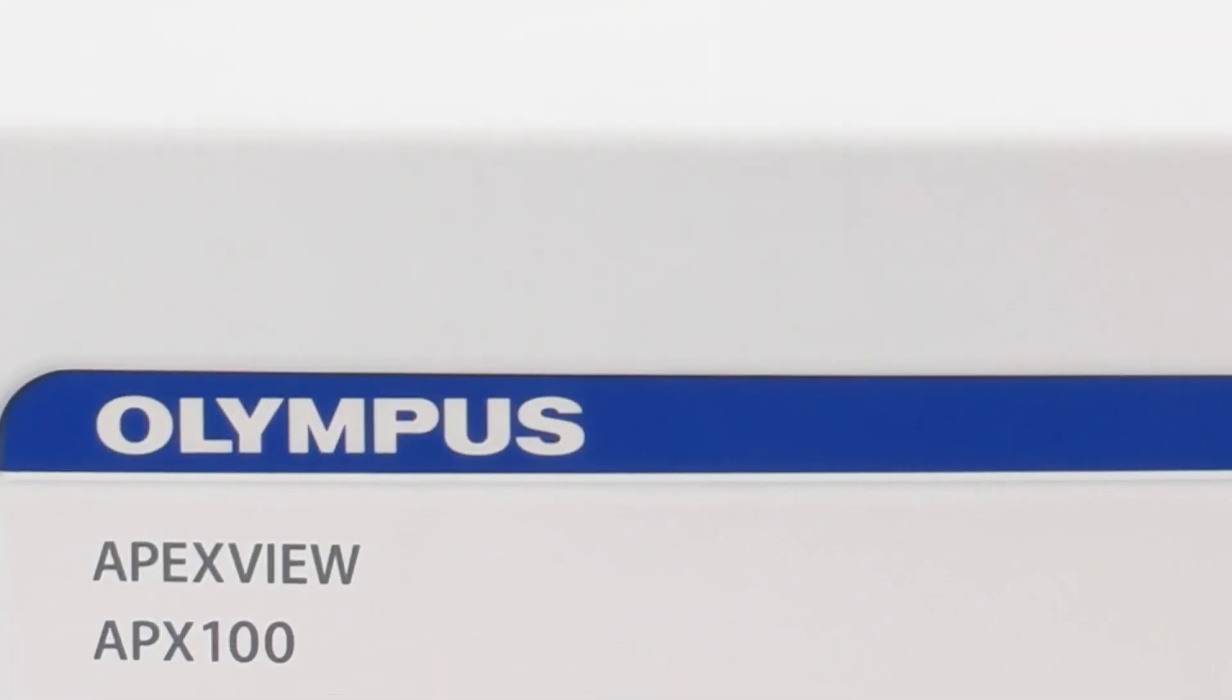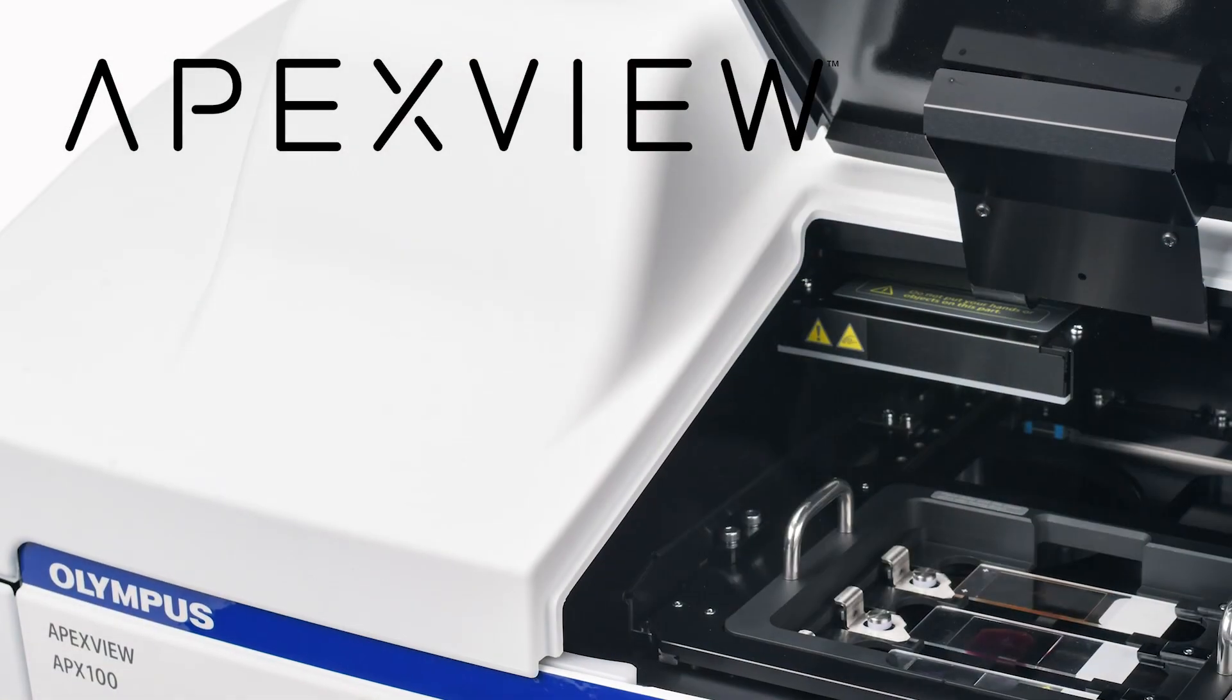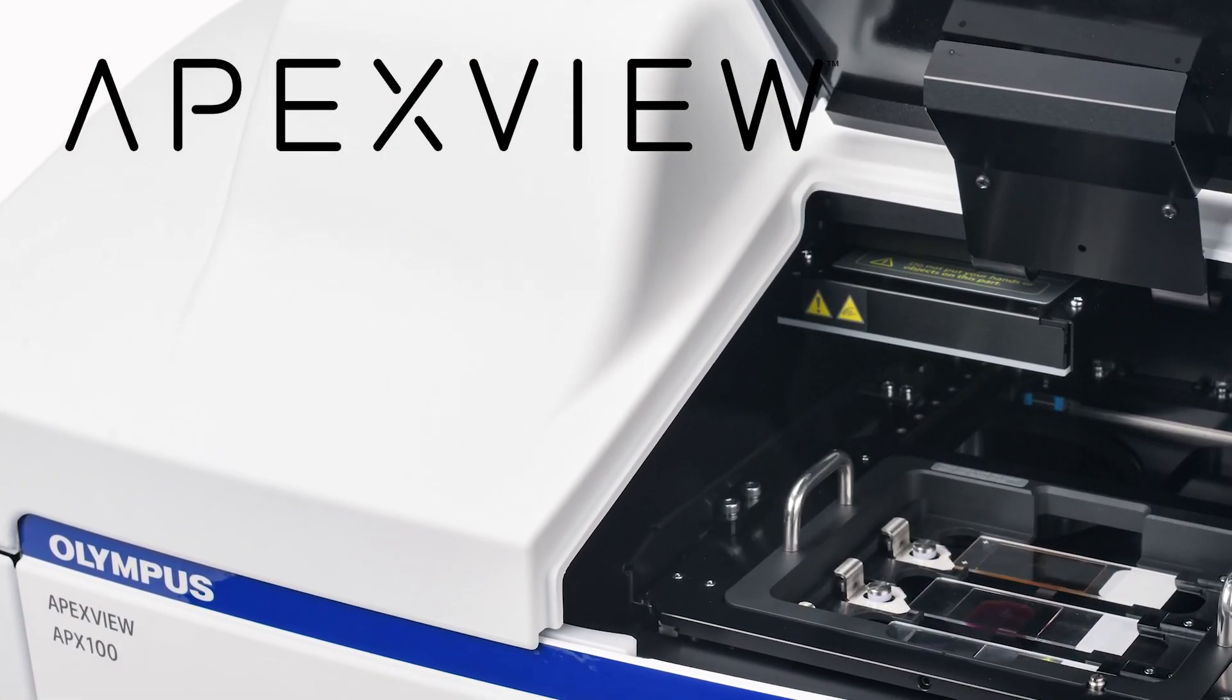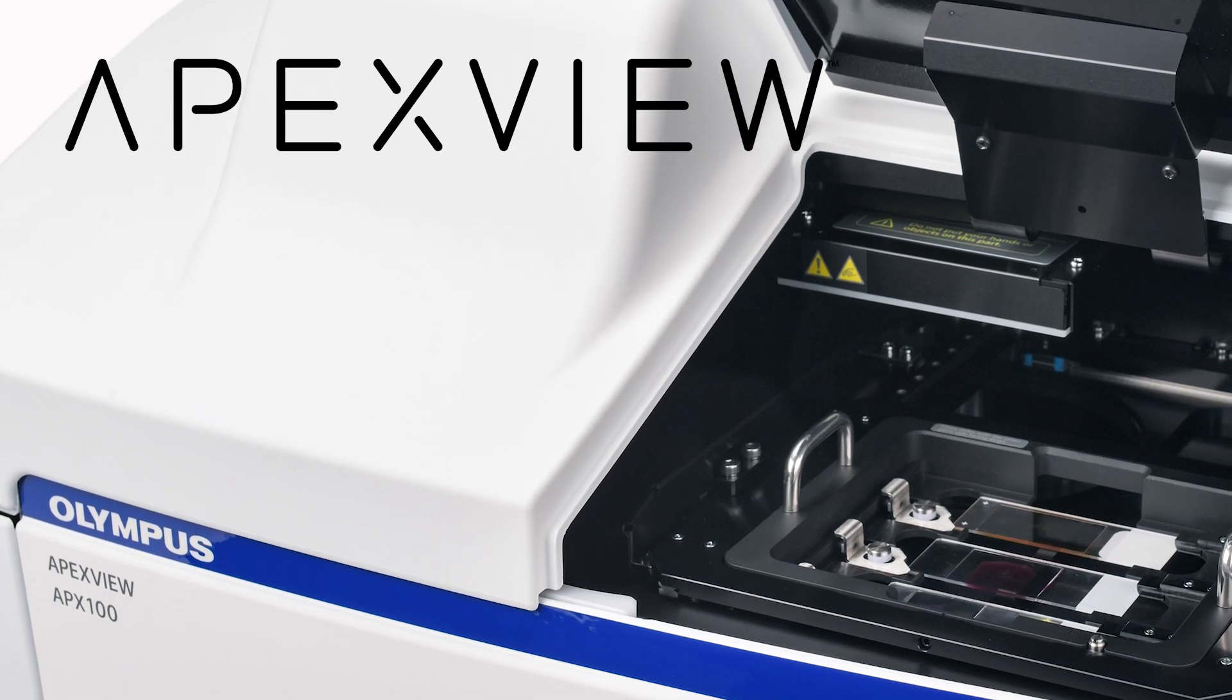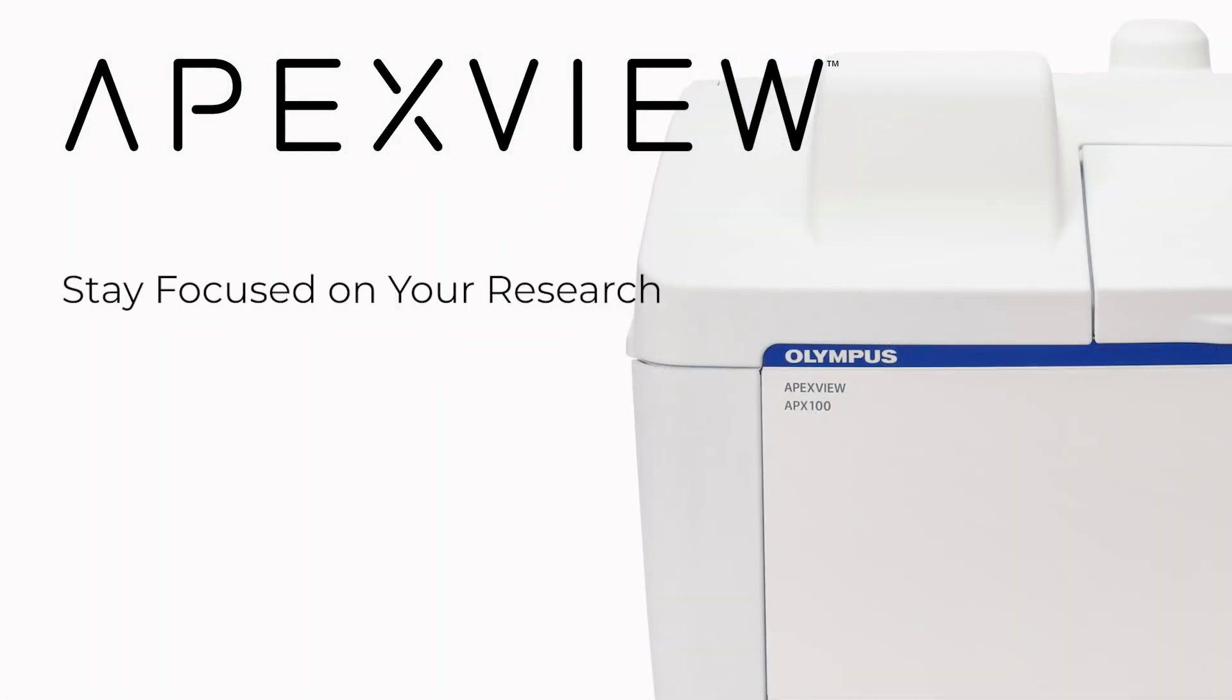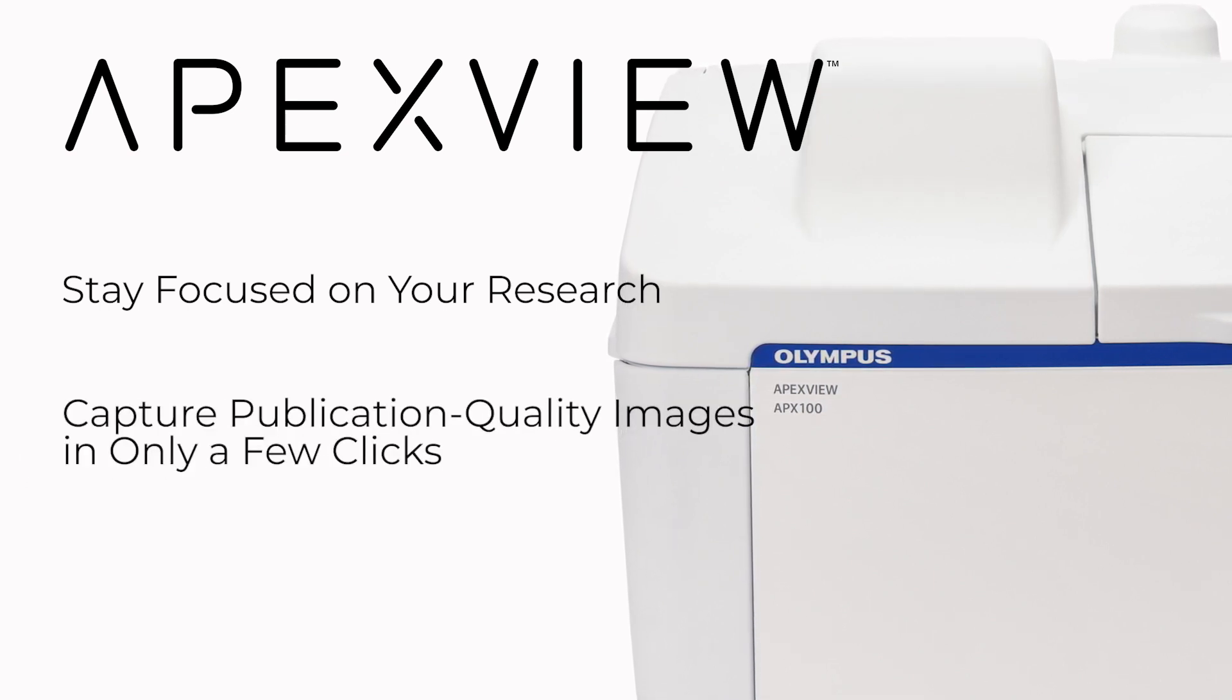With high-quality optics, smart features, and intuitive software, the ApexView APX100 all-in-one microscope makes your imaging efficient, so you can stay focused on your research, capture publication-quality images in only a few clicks.